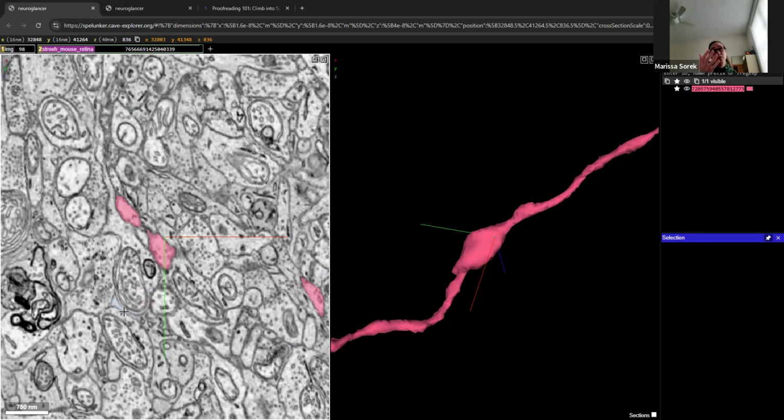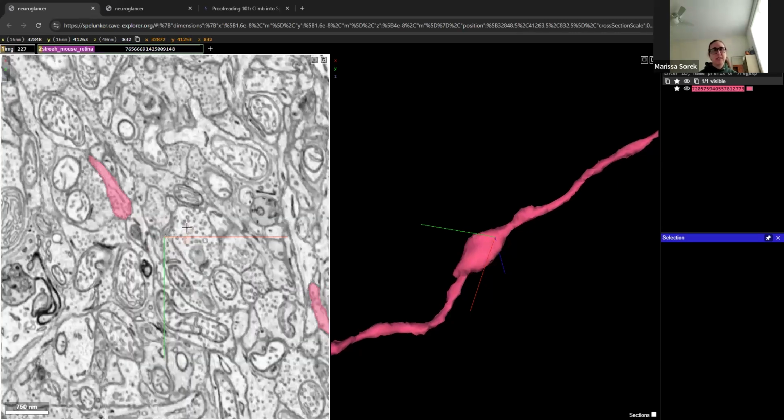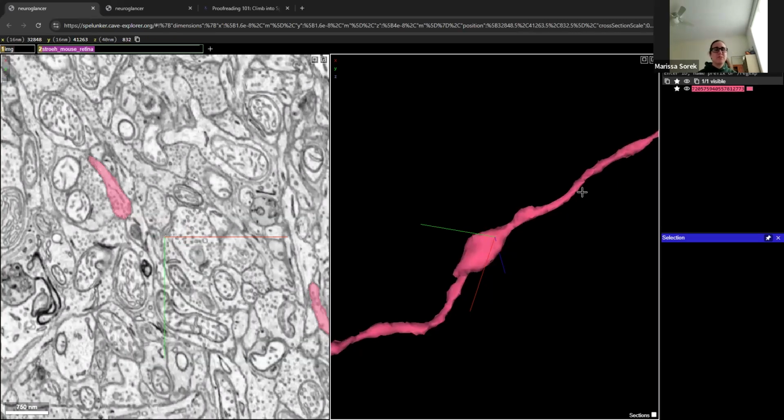The other two views, XZ and YZ, are those composited views where you can see between the slides. We'll show that in a minute and you can see how that looks. But I like to say that if you do accidentally do this, think Control Z to snap you back. I know I've done it multiple times when I first started out. Yeah, me too.